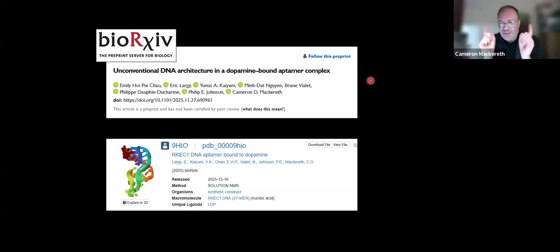It's a very good question because ideally, exactly what you just said. A limitation is this obviously wasn't a rapid thing to do, and there are so many different DNA aptamers or other structures out there that if you could at least get a hint at the start, that would be great. I think it's quite solid, the Watson-Crick part that I mentioned in the 1D spectrum.